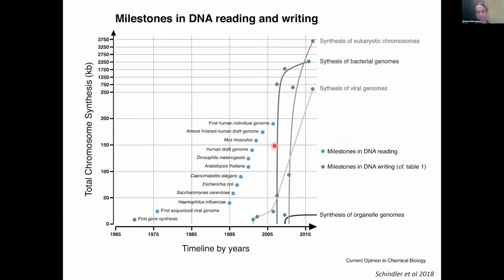This idea of oligonucleotide synthesis: as I said, now we can clone on the order of thousands of sequences up to 300 base pairs. But this process of oligonucleotide cloning is really expanding quickly. And I think one exciting change in the field of cloning will be the ability to synthesize more and more complex things.